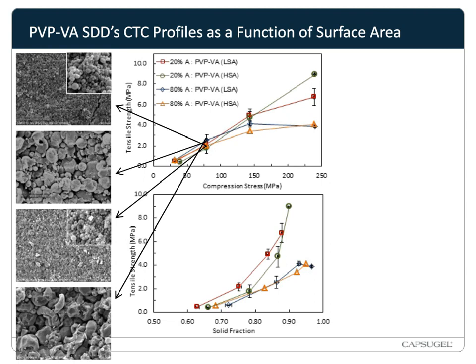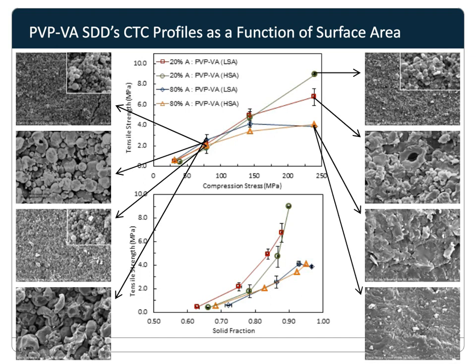And these are some of the SEM micrographs of the cross-section compacts. Generally, when we look at the cross-section compacts, again the mechanism of compaction is similar at the lower pressures, and then at the higher pressures where they diverge, we start to see this plastic flow almost to the point where you aren't seeing particles anymore.